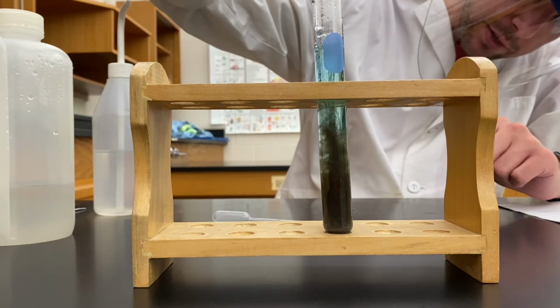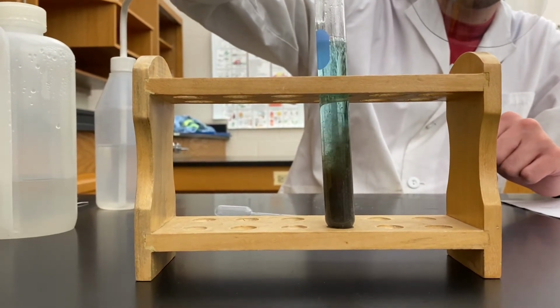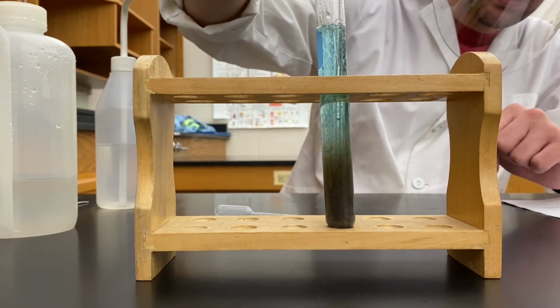You'll notice the black color is going away, and I'm trying to make sure the reaction is complete by getting all of that black away.